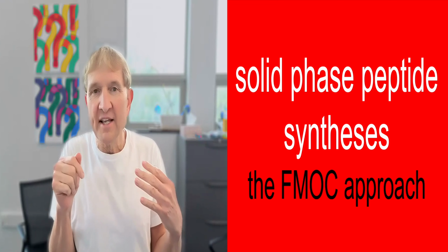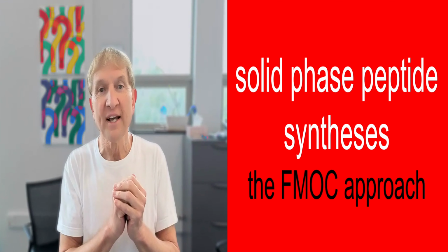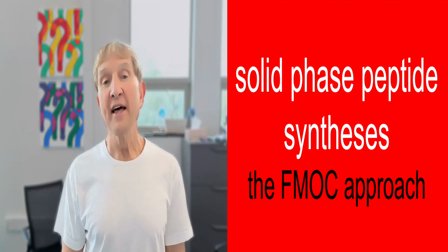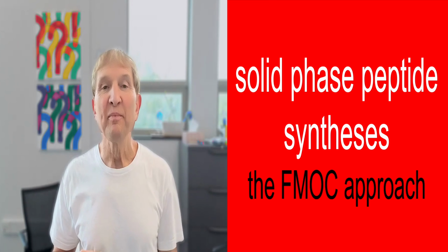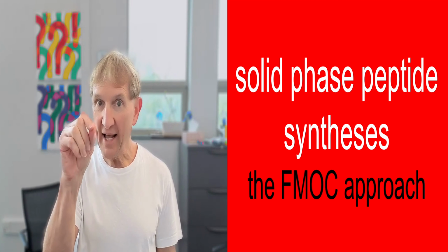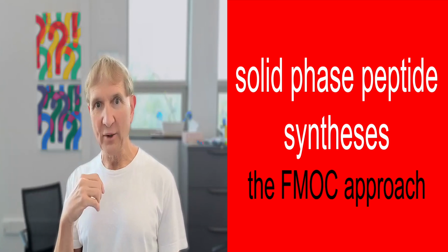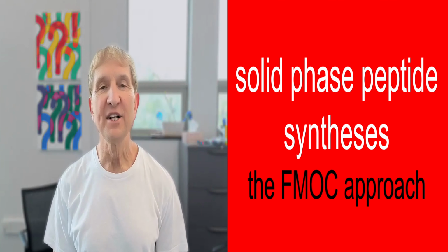Throughout, the trick is excess reagents can be used to drive the reactions to completion. That gives you a high yield. You need that if you're going to do multi-step syntheses with no purification. And then those excess reagents can just be washed away because they don't become attached to the resin. Only the thing that reacts on the resin stays with the resin. The solid support is not dissolved by organic solvents. The reagents are, so they can be washed away in each cycle.